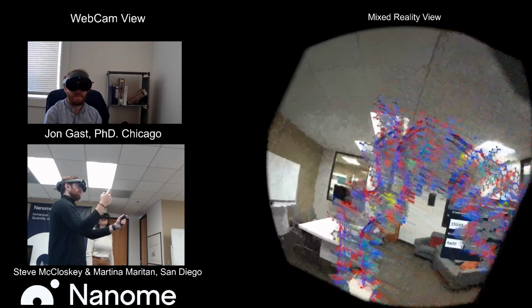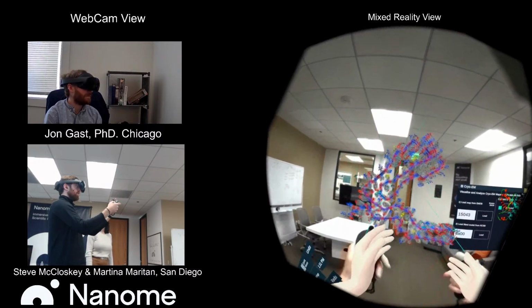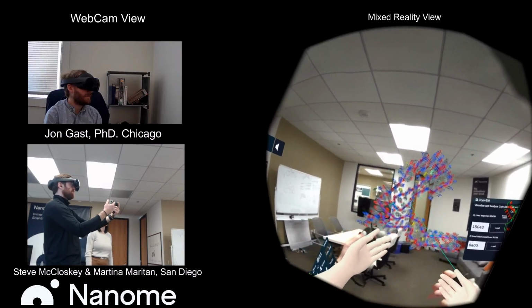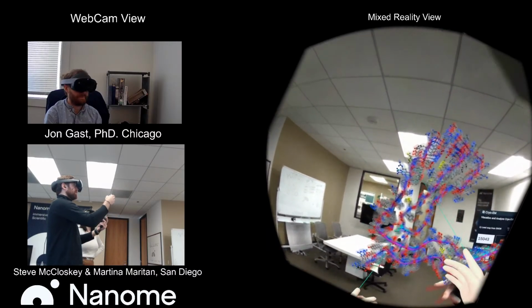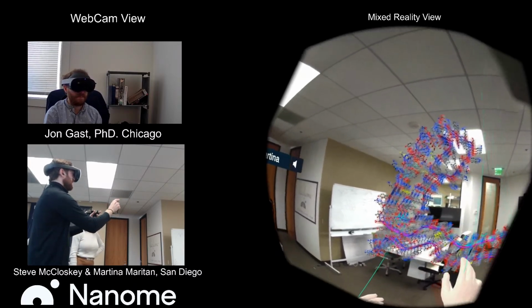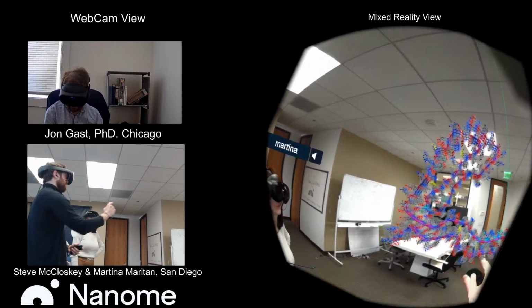But if you're capturing data from electron microscopes, maybe you don't even have a structure yet, or you've already determined the structure and you're working on it, there's really important data in the experimental databases to also analyze alongside. That's what the cryo-EM plugin does: it allows us to analyze and look at the experimental data coming out of cryo-EM.